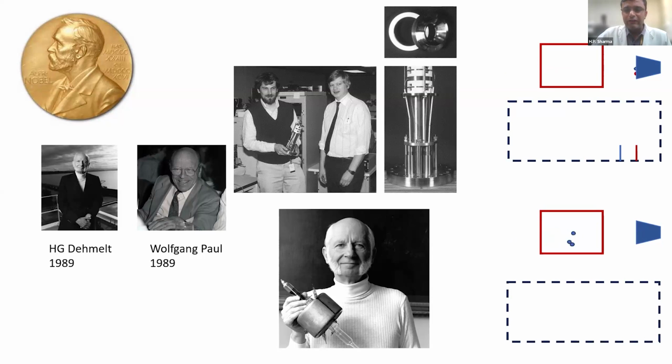But when you activate the trap, the molecules are getting trapped and held for a certain period of time. So you are accumulating the molecules and then releasing them in one go to the detector and your signal is getting enhanced. And I must tell you that in many cases, this enhanced mode, because of this activation of the trap, really helps us in identifying many things.